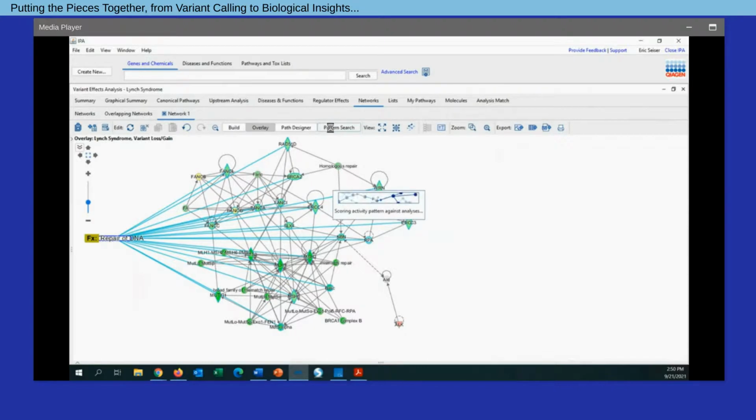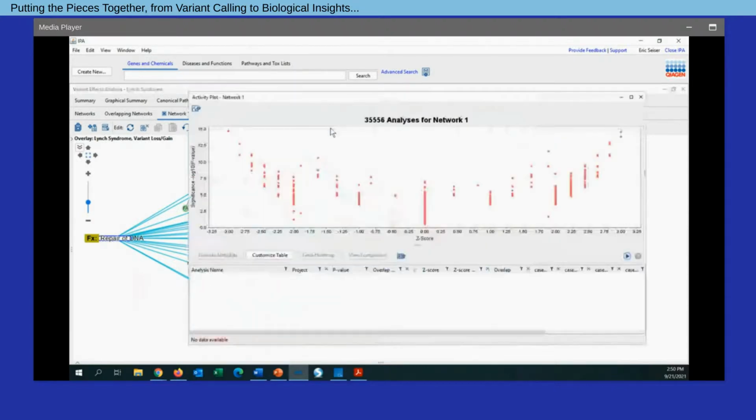This will generate the activity plot that I showed in my slides. Again, here, the key takeaway is that the points that fall to the far right represent gene expression data sets that show the same set of genes with decreased levels of expression, and points to the left, which is opposite of our pattern of loss of function. These are data sets in which we'd expect increased expression of our set of genes.